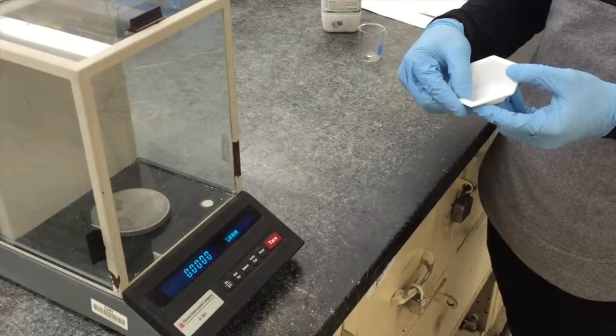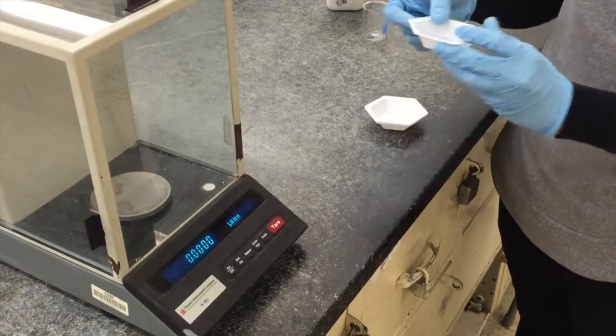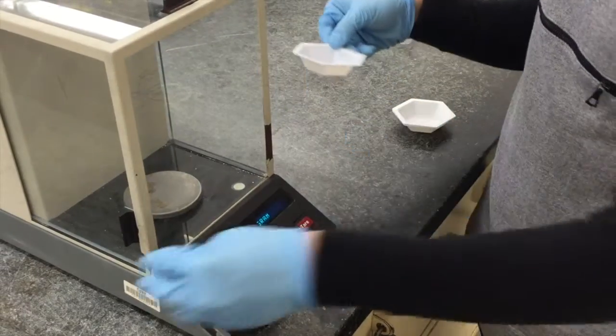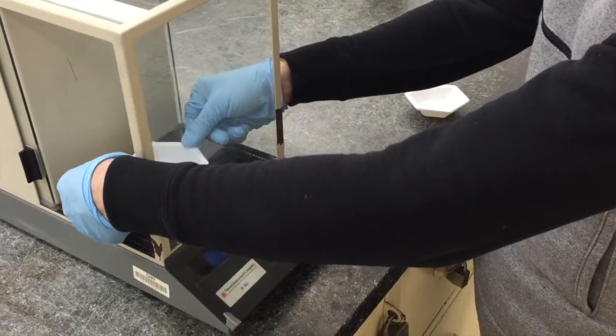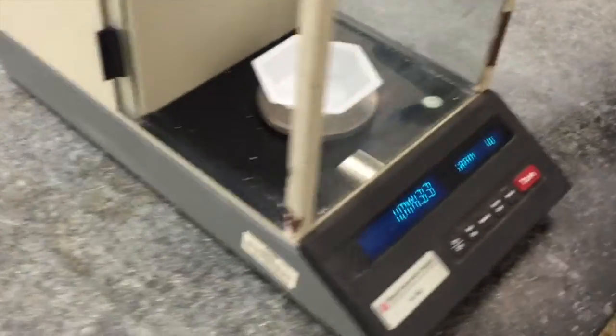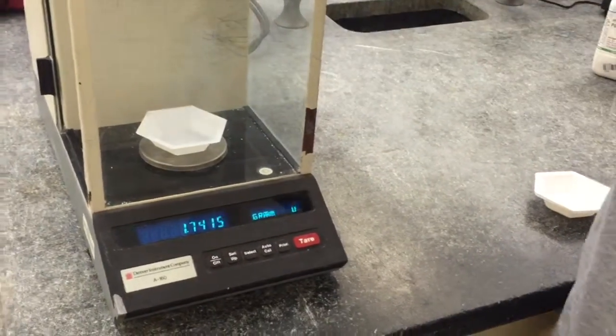Begin by placing your weighing boat on the scale and make sure all sliding doors on the device are closed. The Analytical Balance is sensitive enough that it can detect even the slightest fluctuations in weight due to air currents outside the device. Therefore, it is important to always close the sliding doors before taking any measurements.